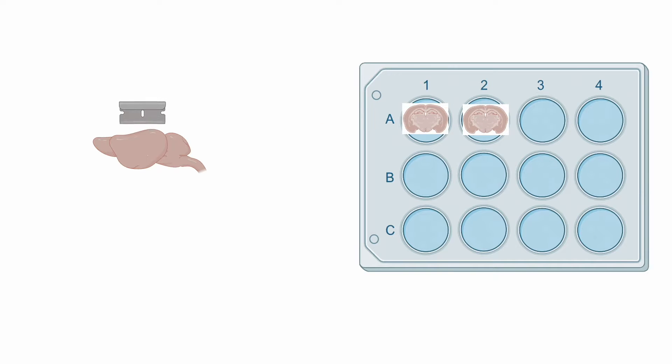Smooth brain sections of precise dimensions produced by this vibratome are crucial to the success of subsequent experiments involving immunohistochemistry and electrophysiology. This video will take you through the steps of tissue preparation and instrument operation.